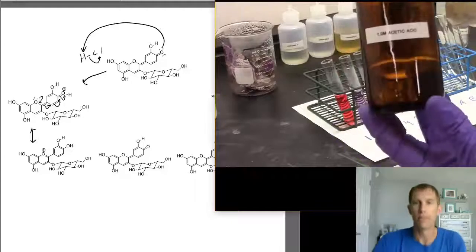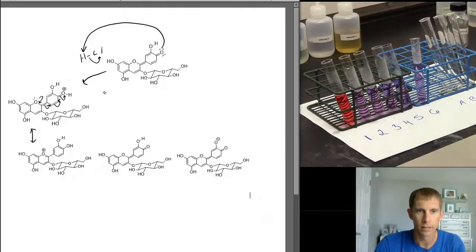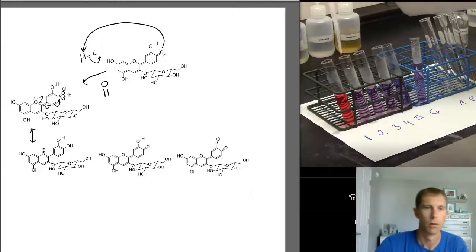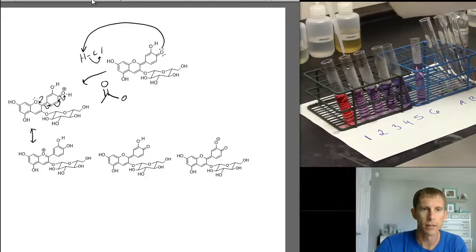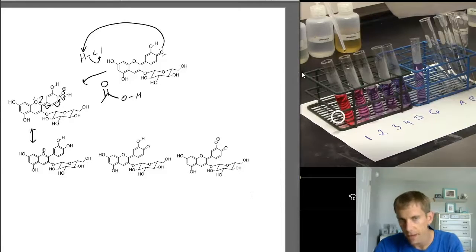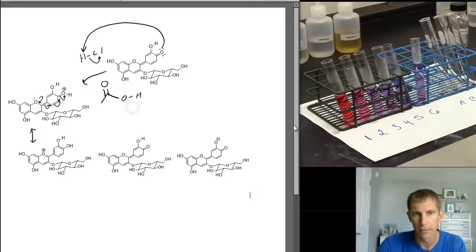Now in the next step we're adding a slightly weaker acid. So in that case we're adding acetic acid. So for the molecular structure for acetic acid, we have a carboxylic acid functional group. When we add this, it's still turning red, but I think that not all of the equivalents of acetic acid are being deprotonated.